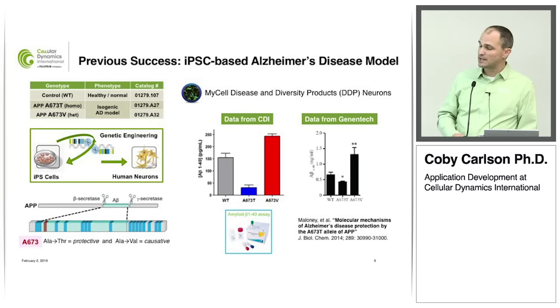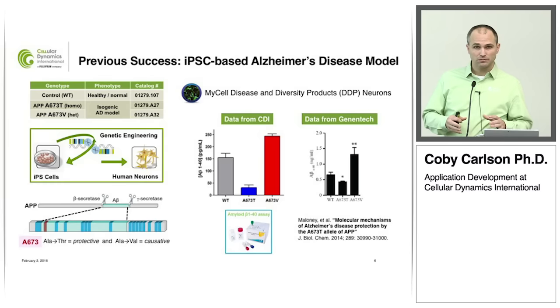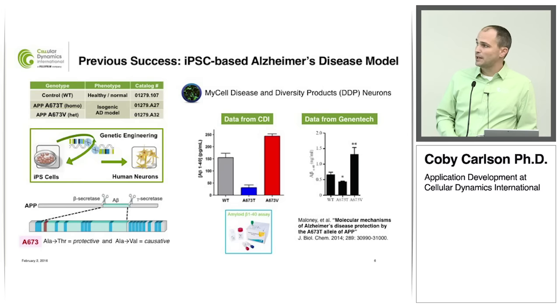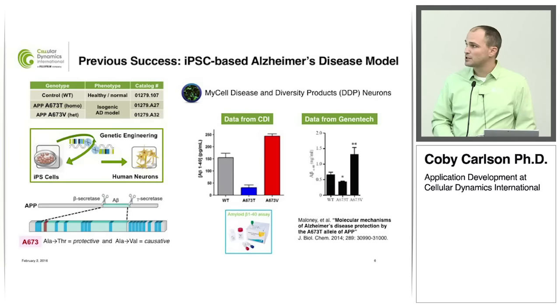And so this is taking our normal iPS line and engineering that at the iPS level to introduce 2 different mutations. And they're listed in there. They're 2 disease-relevant mutations that modify the amyloid precursor protein, and they're actually at the same amino acid site, 673, and an alanine mutation. And one change makes the disease-relevant modification, makes it protective. And again, there's a lot more to talk about. And then the other one makes it pro-amyloidogenic. So it's really kind of interesting.